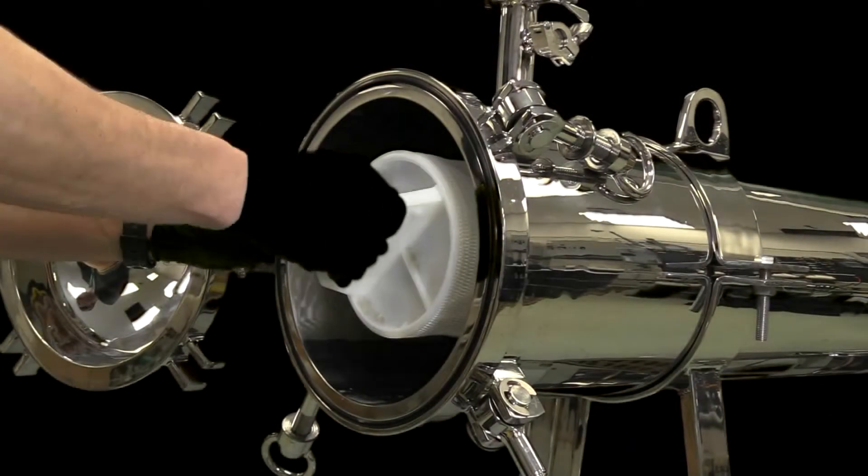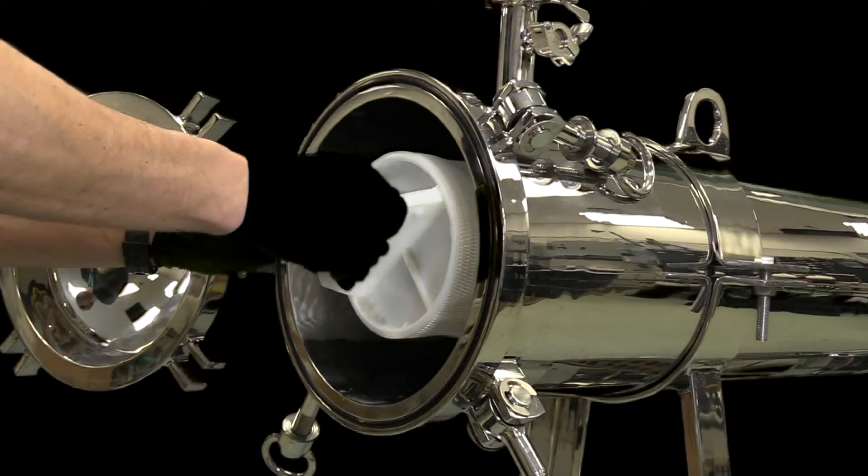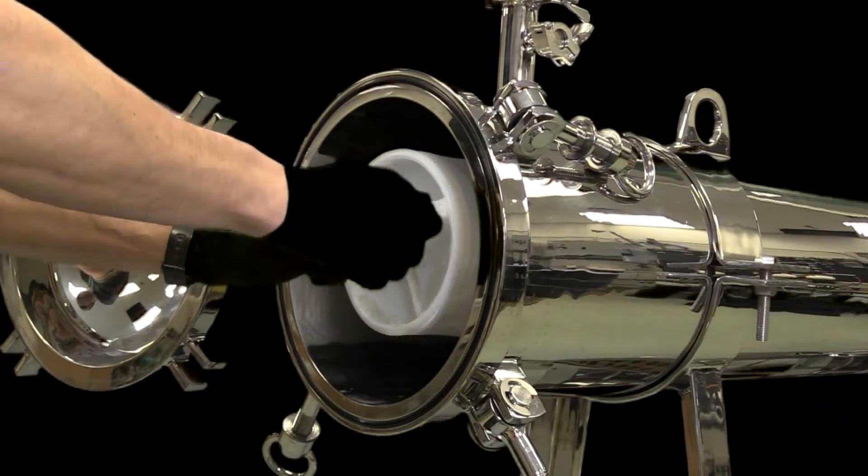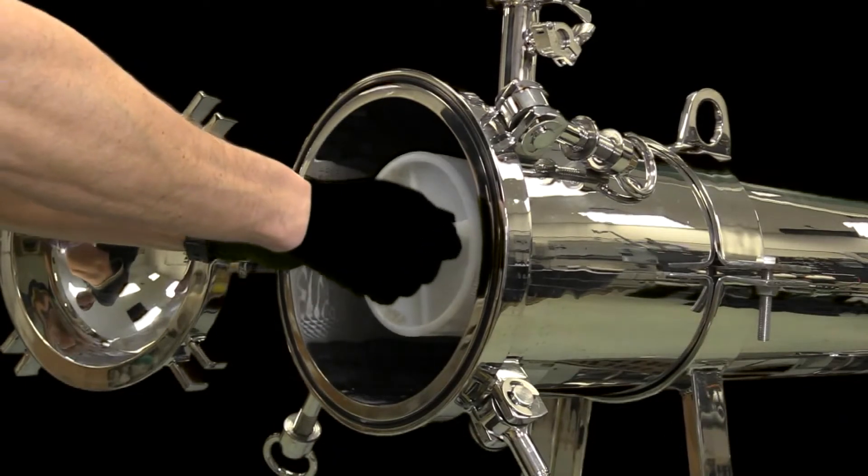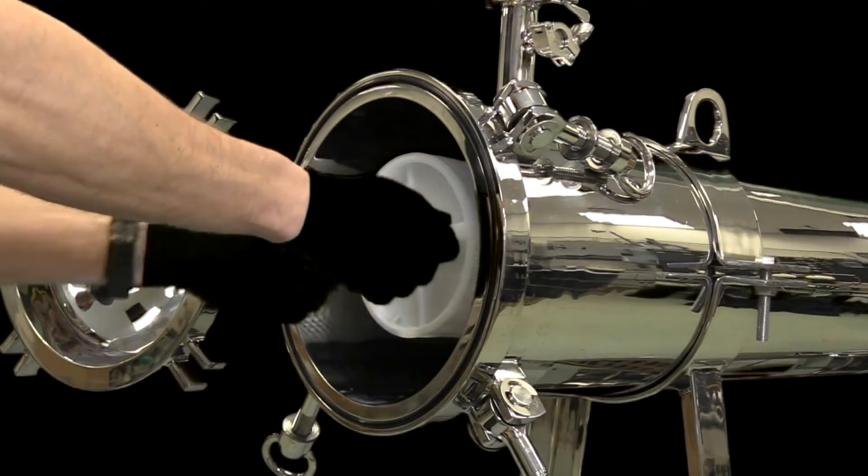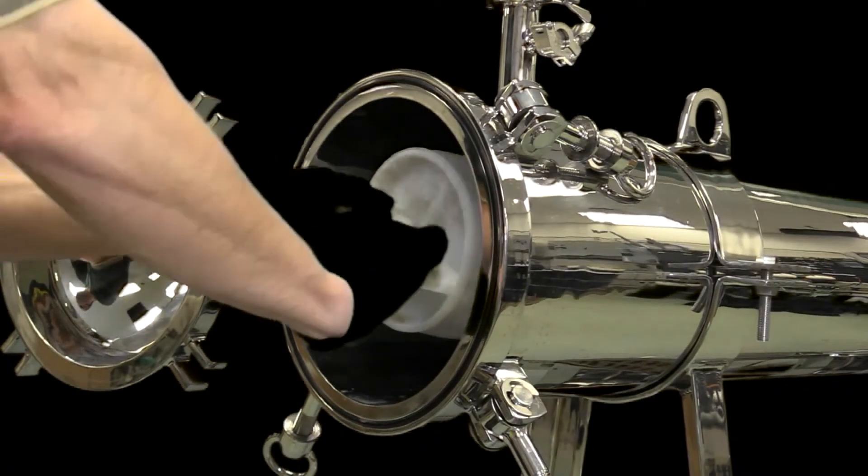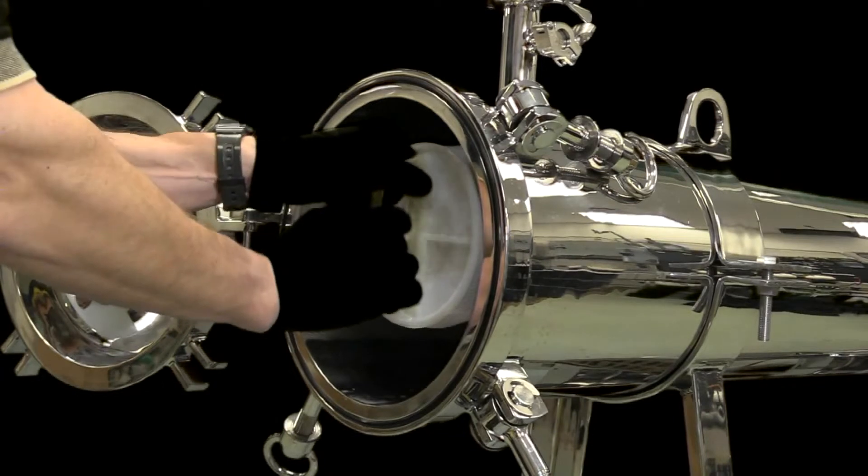Then carefully guide the filter over the support post and into the high-flow housing. A positive stop will be reached. Push forward lightly while simultaneously turning the filter in a clockwise direction. The filter will then insert further and reach another positive stop. Stop pushing forward and simply turn in a clockwise direction until it is not possible to turn the filter further.